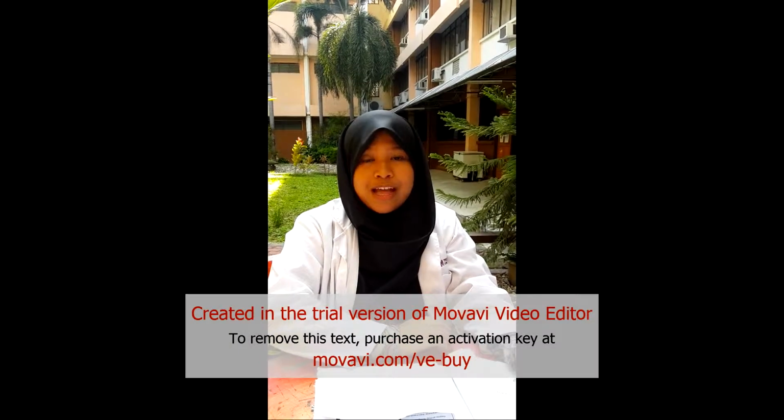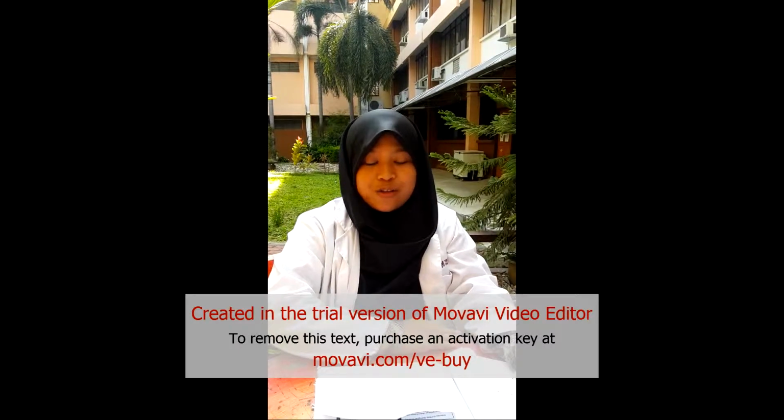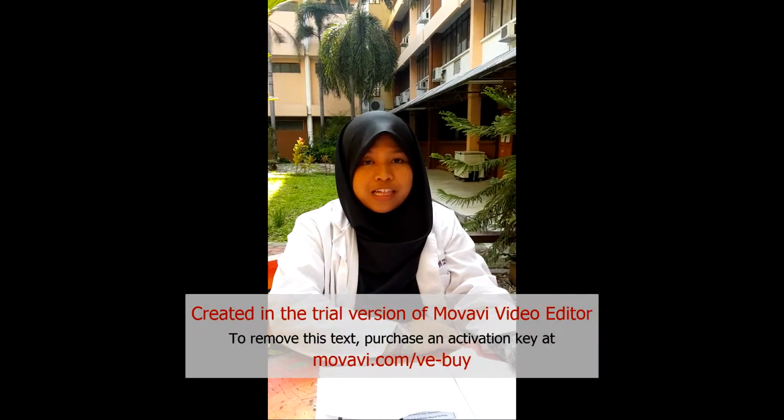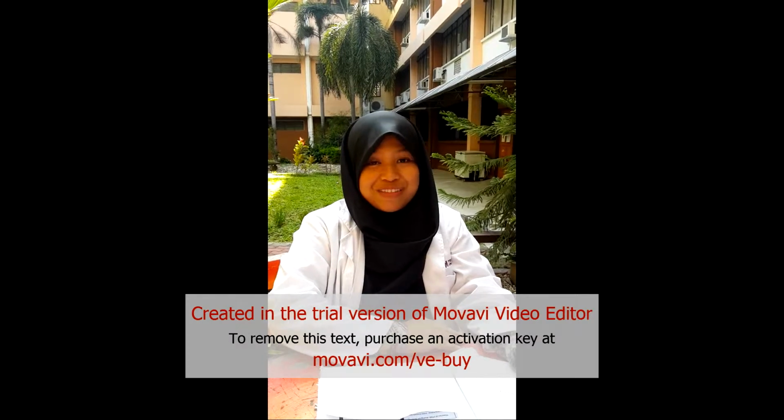Hello, my name is Nur Ain Fatiha. I will tell you about the advantage of photobioreactor. The advantages of photobioreactor are it can produce higher productivity of algae because cultivation of algae is under controlled circumstances. Second, better control of gas transfer. Third, reduction in evaporations of growth medium. Fourth, more uniform temperature. Fifth, better protection from outside contamination. Sixth, space saving because it can be mounted vertically, horizontally, indoor or outdoor. And lastly, it can reduce fouling.